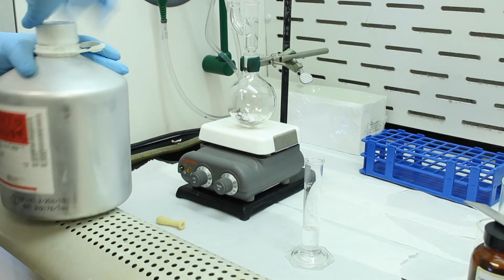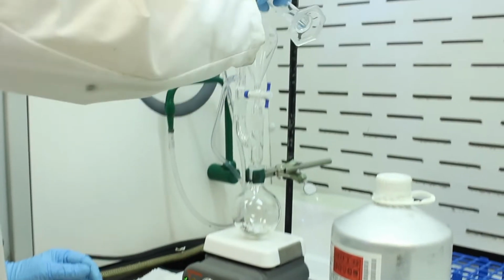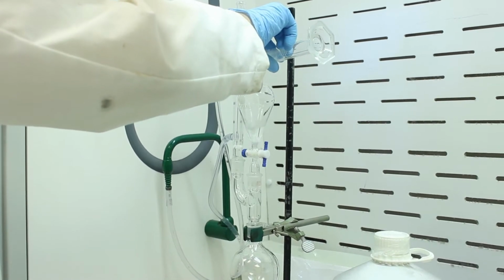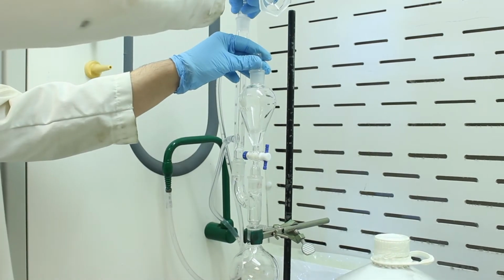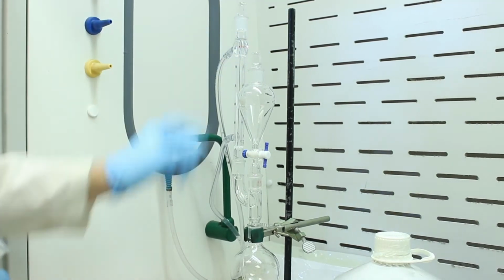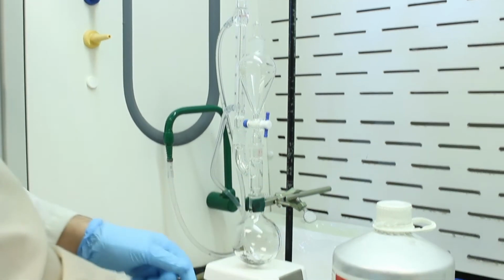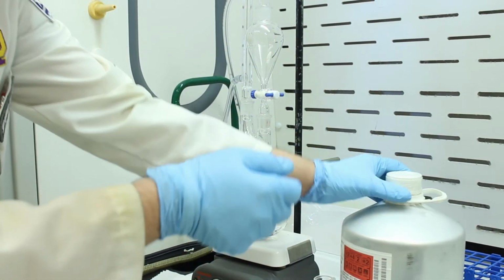Quickly stopper the container, and then we'll add the ether. You can see the apparatus is still warm enough that it's actually vaporizing some of the ether. So there we go. Okay, so we've added about 10 mils of ether in there, so you can see the vapor pressure is so high that it's actually causing the stopper to bounce. Anyway, so now we're going to close it. So we've added around 10 mils here. Now we're going to put 20 mils in here to it.